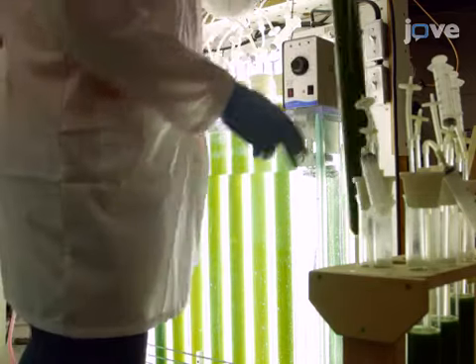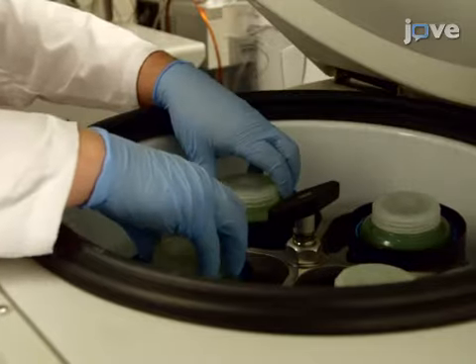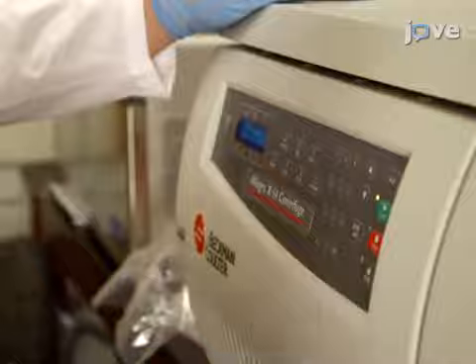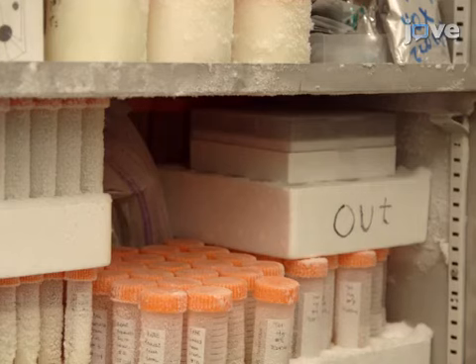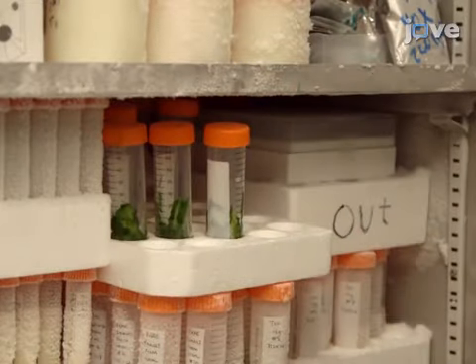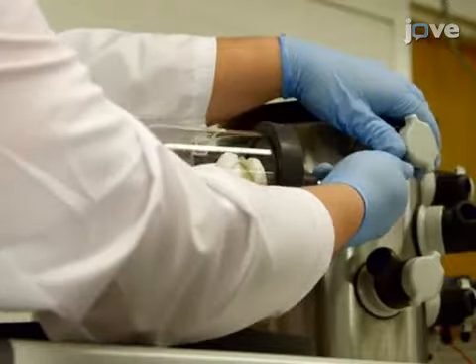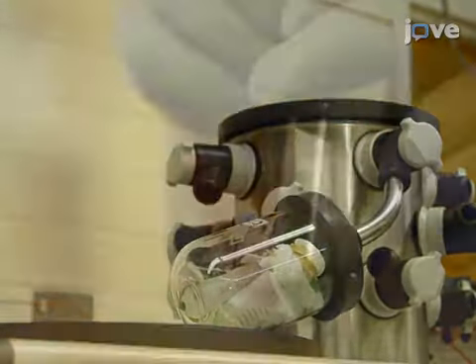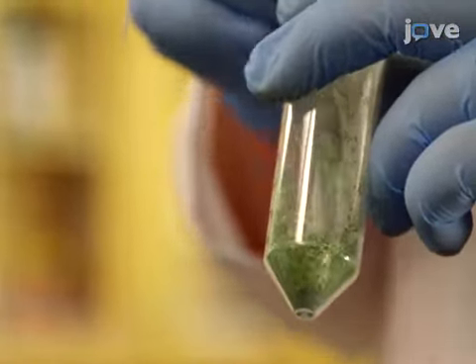After growing the cultures for 7 days according to the text protocol, harvest the biomass by centrifugation at 9,936 times g. Collect both the biomass and supernatant medium and preserve at -80 degrees Celsius. Then, freeze dry the biomass at 0.1 millibars and -50 degrees Celsius overnight. Use a spatula inside the centrifuge tube to powder the biomass.